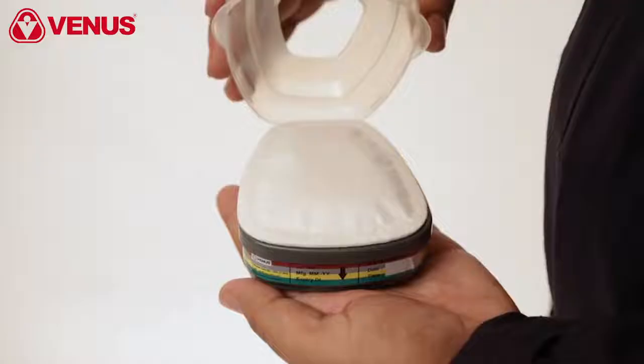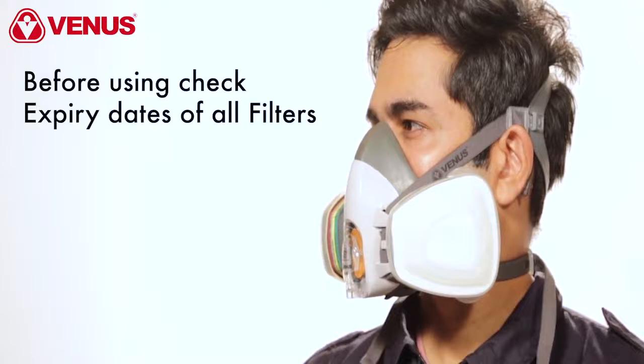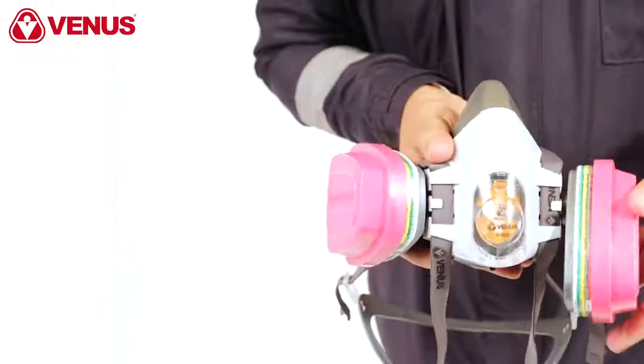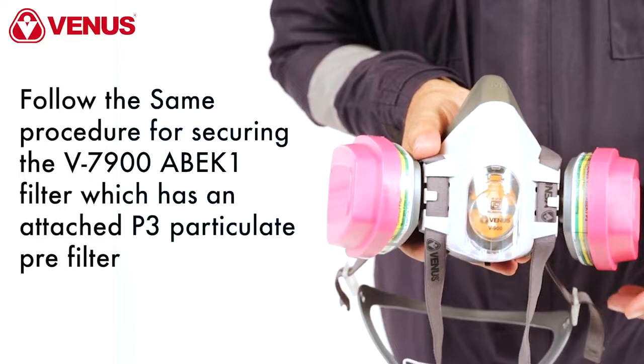To fit a gas and vapor filter or combination filter, place the pre-filter inside the retainer cup and tighten securely. Before using any respirator, check whether the filters are within the mentioned expiry date. You can change the pre-filter by removing the cap and replacing it with a fresh pair. Follow the same procedure for securing the V7900 ABEK 1 filter, which has an attached P3 particulate pre-filter.